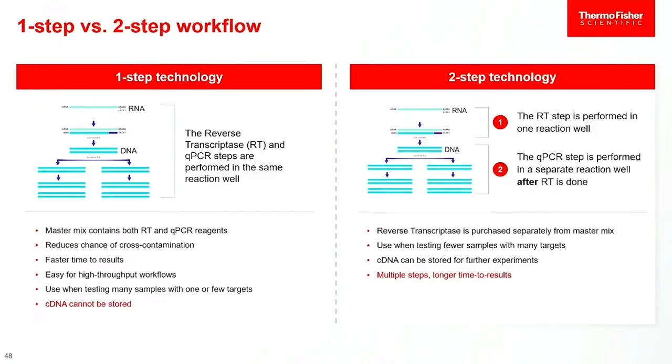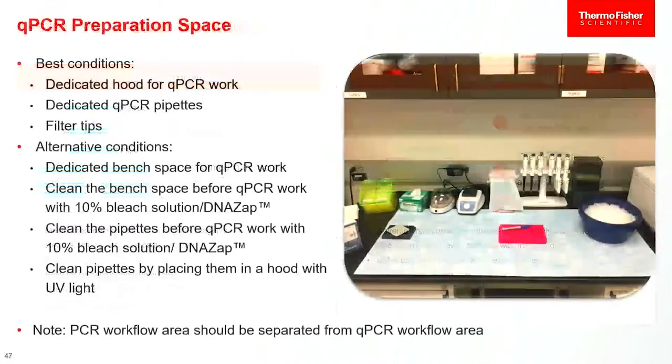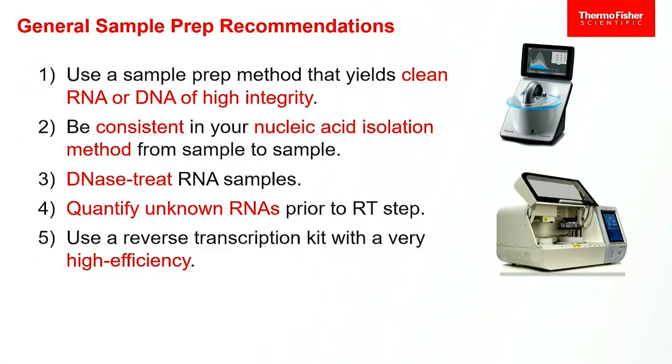No, that's going to be high quality. You're talking about the last slide. Mostly what I was talking about was making sure that you had good material that goes into the reaction. So once you're past that first hurdle, you're pretty much good to go.